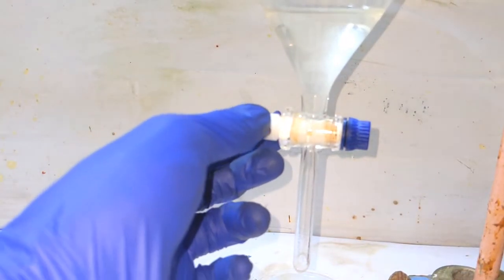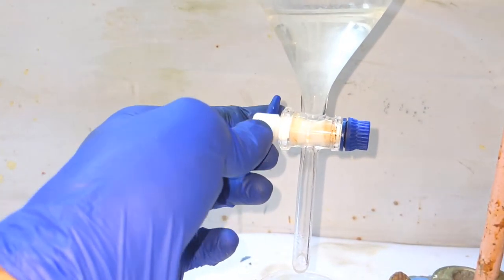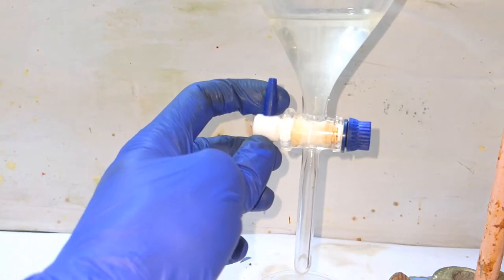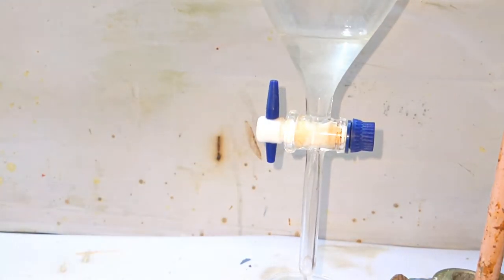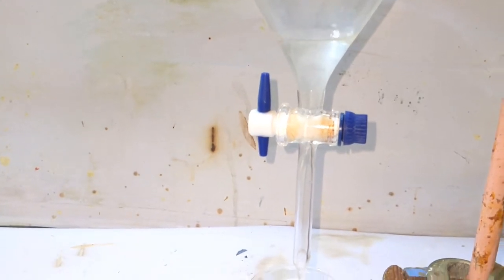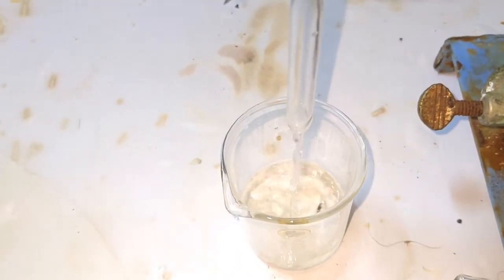Now we wash the organic layer again with some distilled water. So in total, we had three steps of washing: the first step was with distilled water, then we washed with some saturated sodium bicarbonate solution, and a third washing was given with distilled water again.